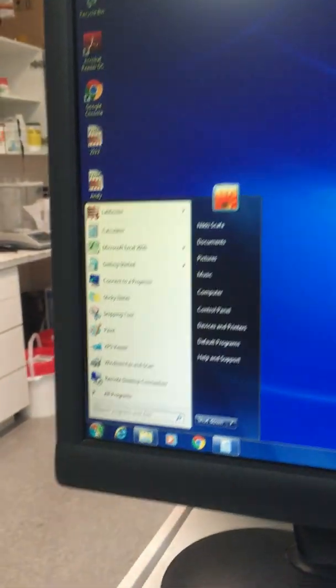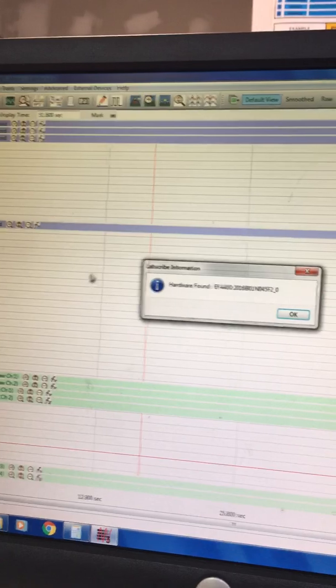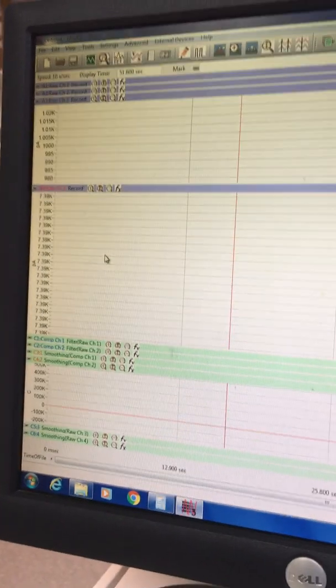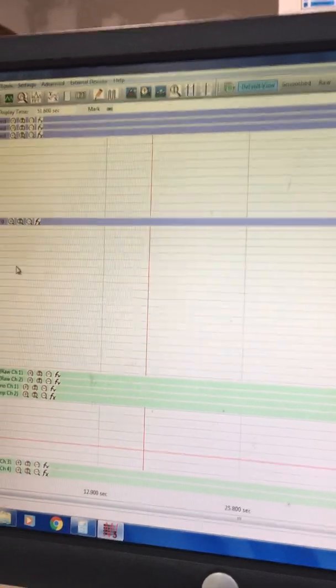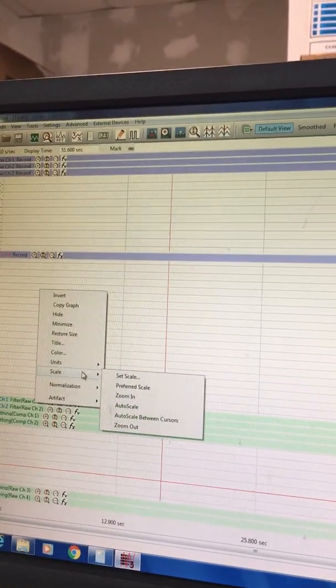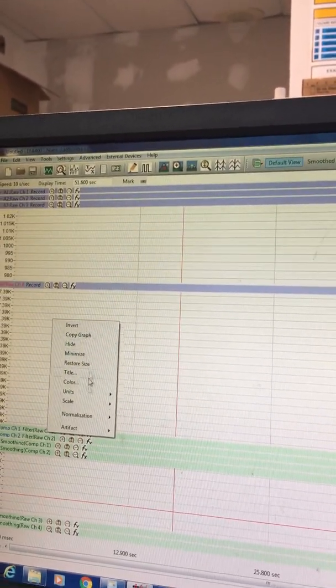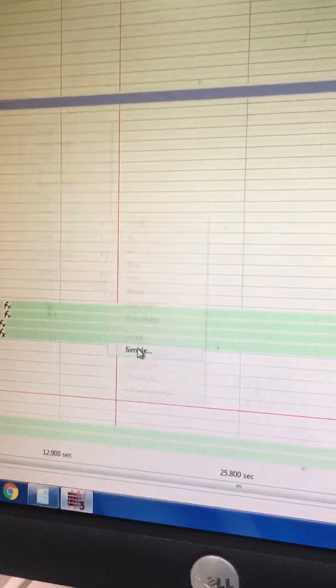Now the next thing I'm going to do is I'll be launching the LabScribe software, and you see this message. I click OK, and next you will go to the units and change the unit. So I go to the unit button here, and I'm on channel 4. So again, if I go back here, I go to the units, I go to simple, I click simple.